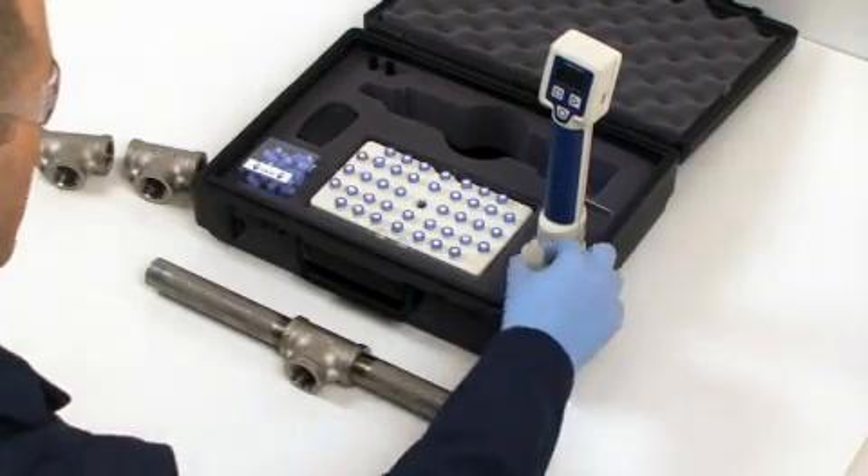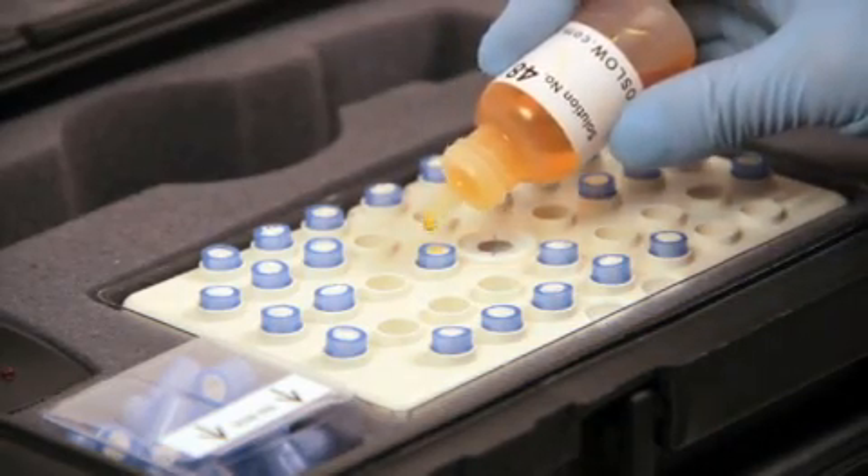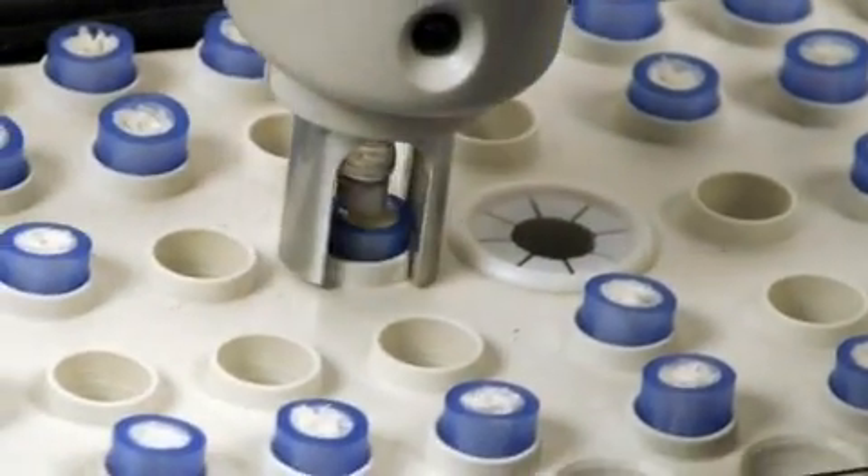The first step of using the Passiflash 3036 is to apply two drops of solution to a nib. Next, pick up the moistened nib with the probe.